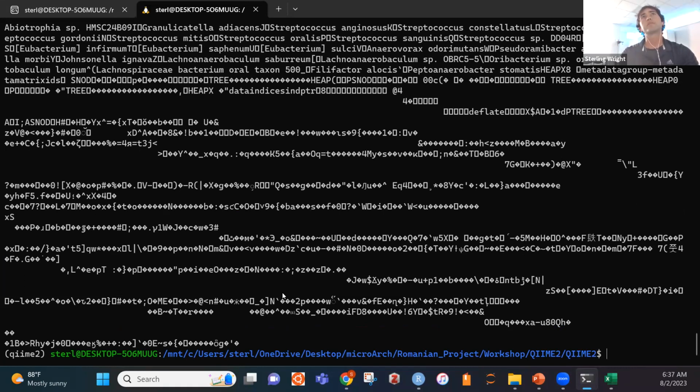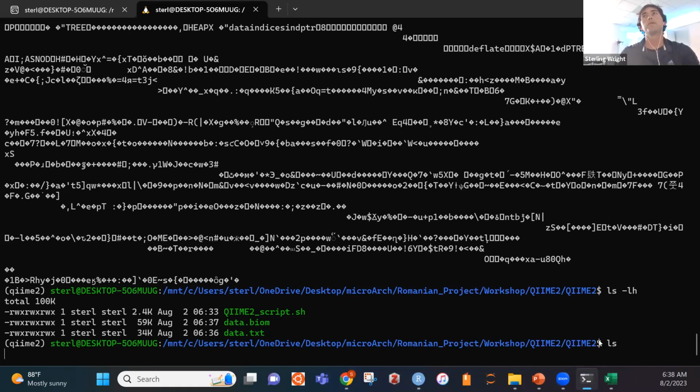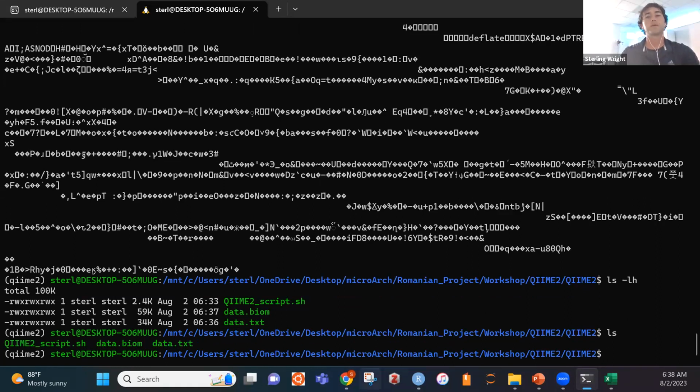This is because they're compressed files. By doing this, they take up less space. Well, not necessarily less space, but they're more compact in a way, more compressed. But basically, they have the same information in them, just how they're stored is different.